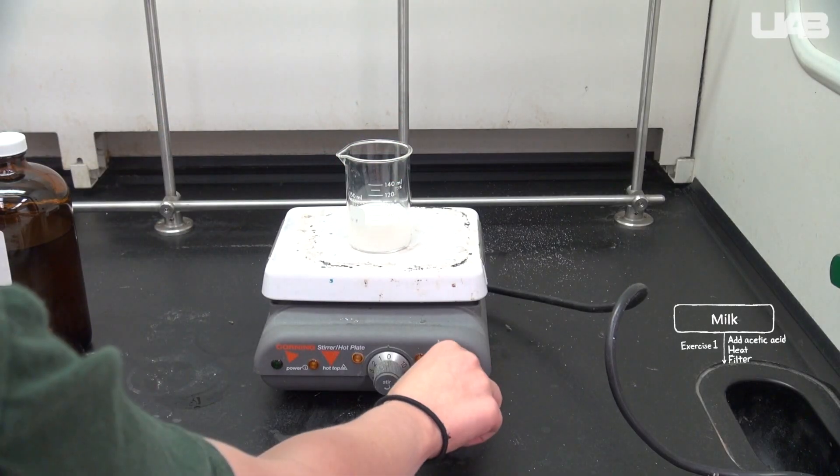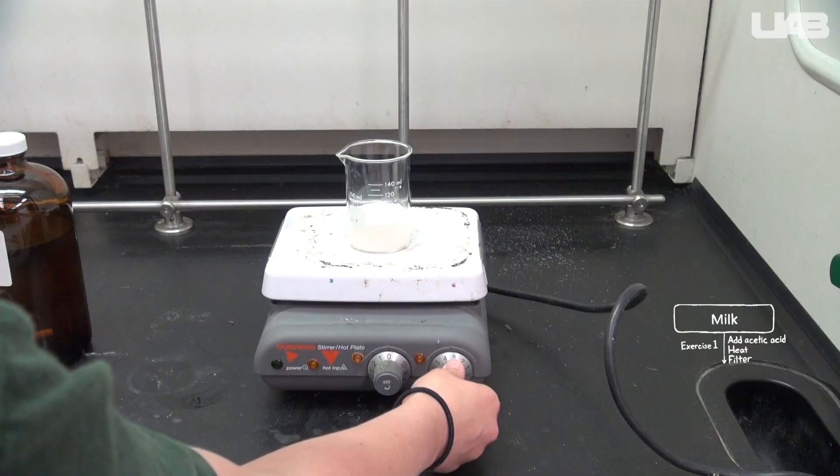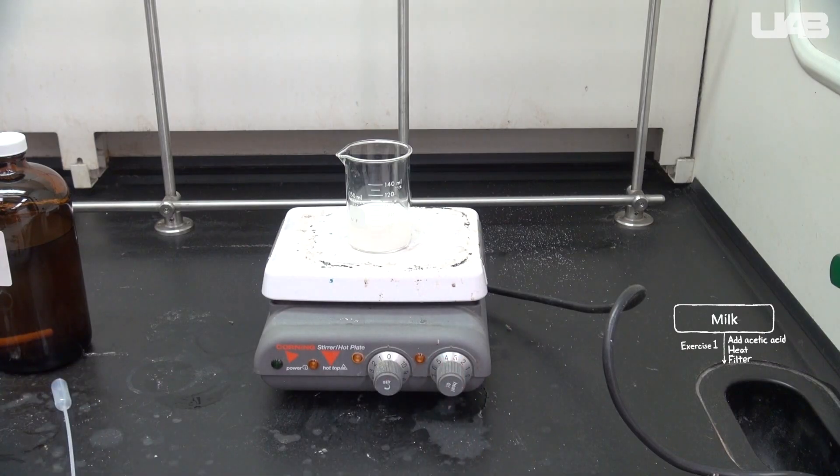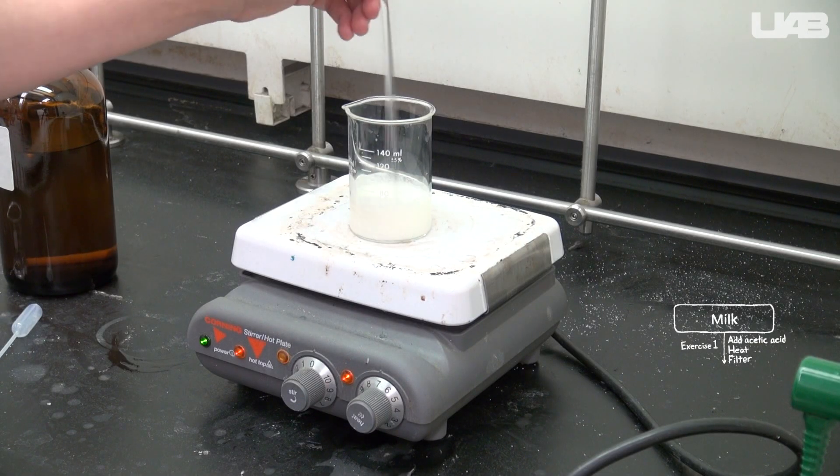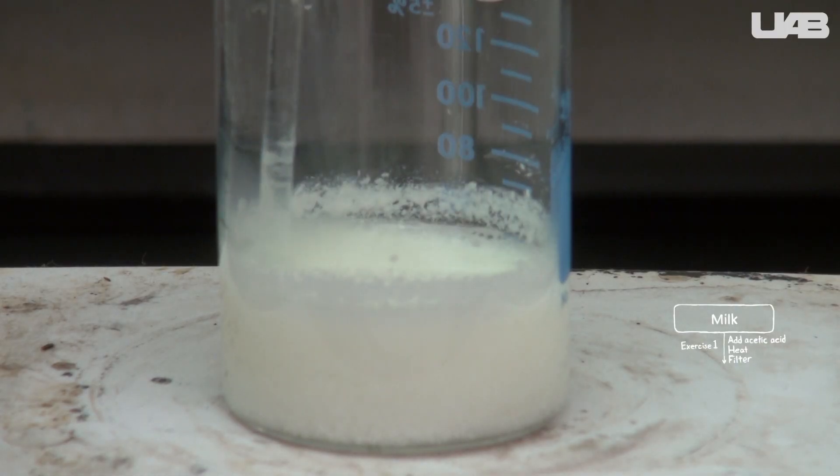Place it on the hot plate. It should be set at about three, but if it seems like it's not hot enough, you can turn it up slowly. Stir the mixture until the protein and fat precipitate. This may take a while.